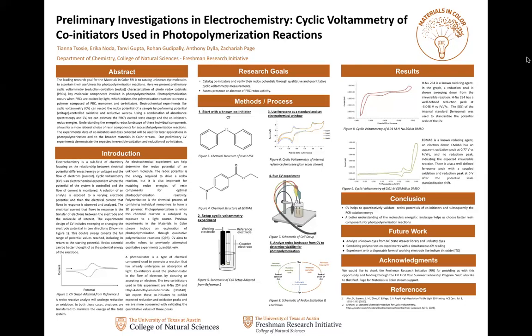Our initial CV experiment demonstrates the expected co-initiators' redox potentials. The first step was identifying co-initiators of interest. The two co-initiators used in this experiment are HNU254 and EDMAB. We verify the shape of these peaks using CV and ascribe the redox potentials of these co-initiators.